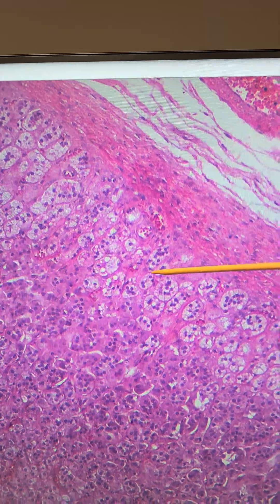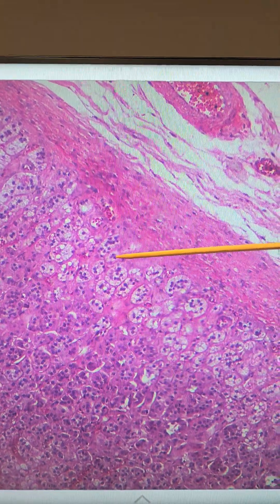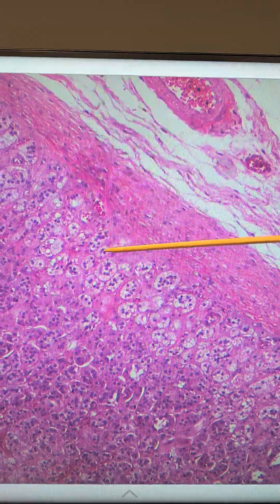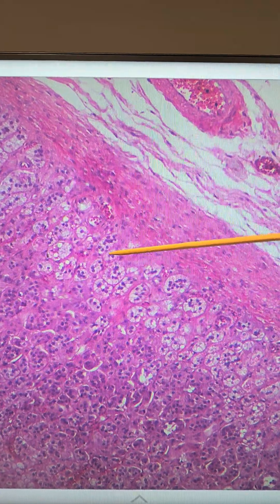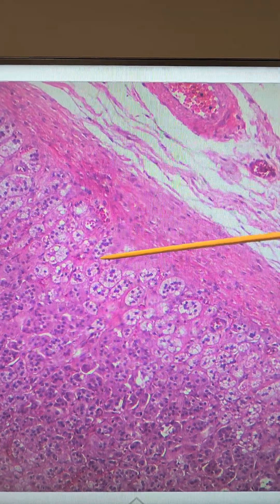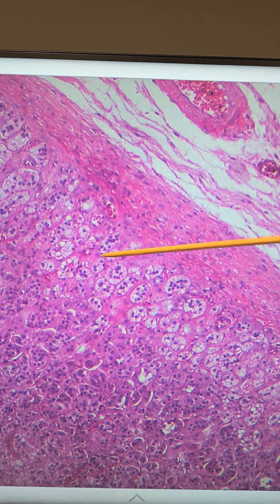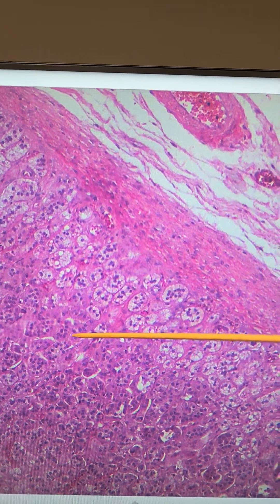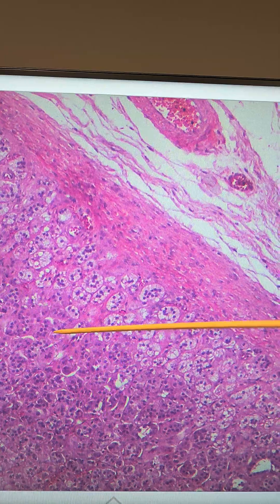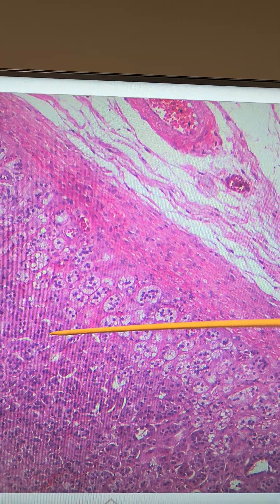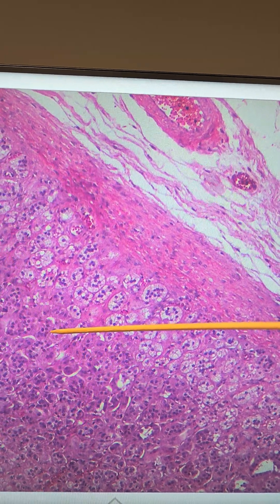Here we have the cells of the zona glomerulosa in the adrenal cortex. The zona glomerulosa produces a mineral corticoid known as aldosterone. The next layer, the zona fasciculata, produces the glucocorticoid known as cortisol.